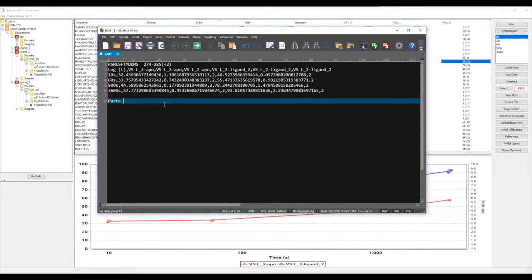But essentially, if you set up a standard XY Prism plot, this will paste in directly and allow you a quick way to generate publication quality uptake plots.